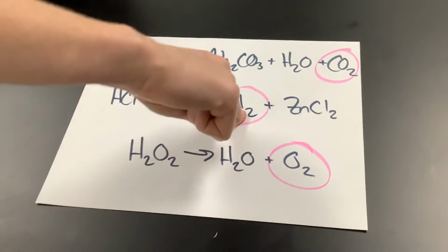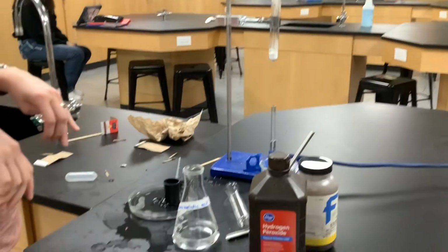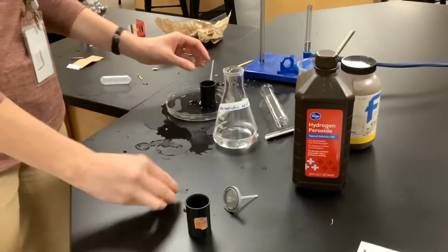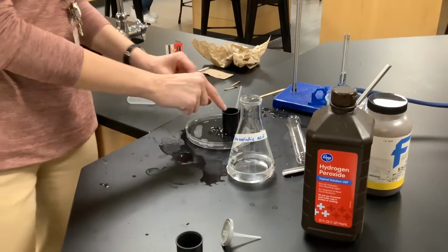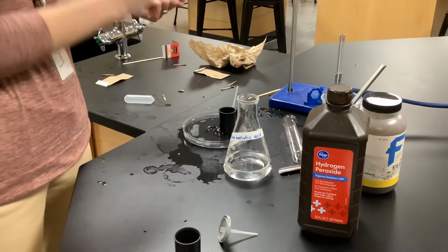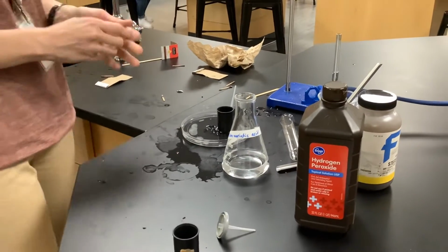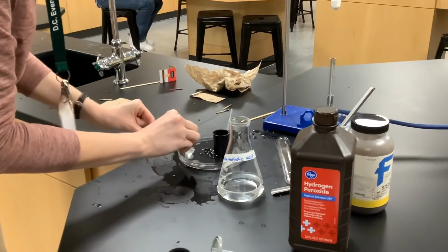So same thing we're gonna do here, we're gonna produce hydrogen gas, and then we're gonna use the flame to be able to test for that. So I need those 2 reactants. I'm gonna put my zinc right in here. The reaction's gonna happen in this film canister, and I need a way to capture it because hydrogen is a lot less dense than the air is. So if we did it in a test tube like that, it would just float up and away. So we're gonna capture it in this pipette bulb.